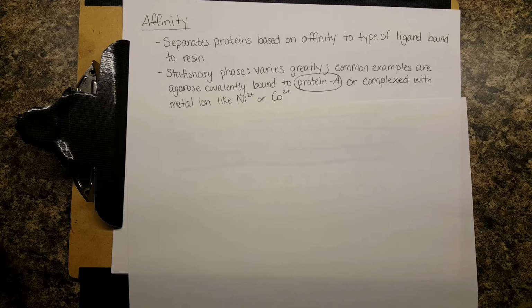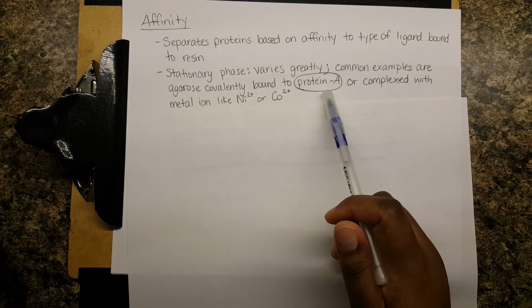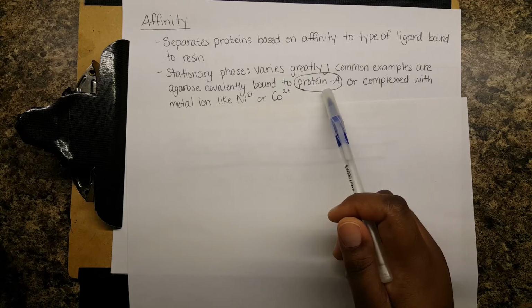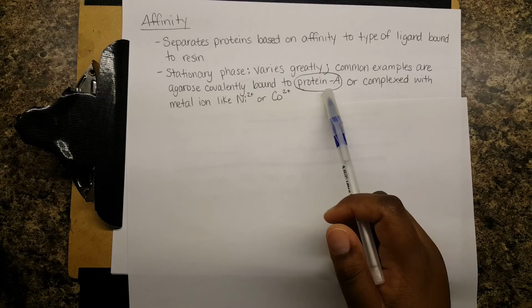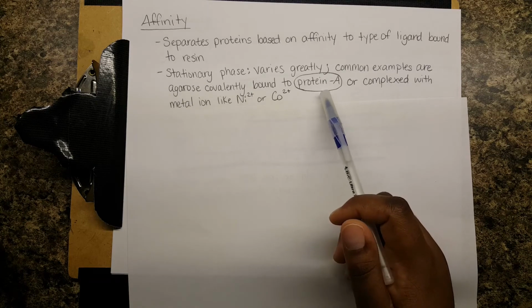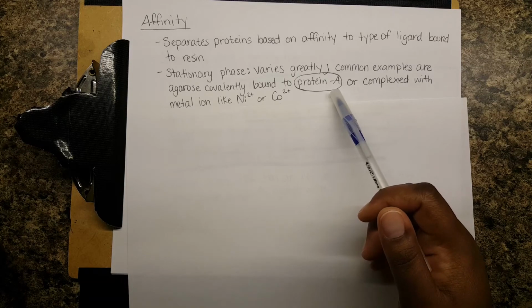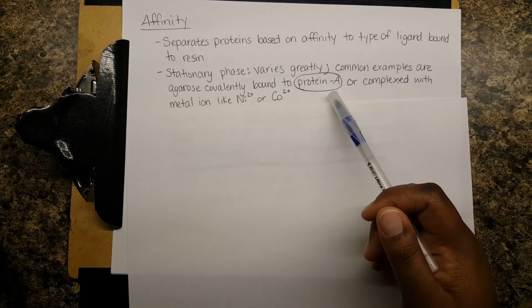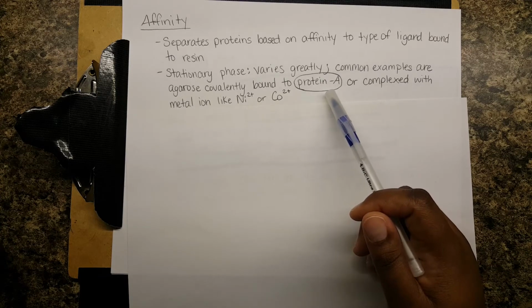A very common example is agarose that's covalently bound to protein A. Protein A binds really tightly to IgG type antibodies. So if you have something where you can use that to your advantage, you can have some kind of a tag on your protein that enables it to interact with protein A, and then all the other stuff will flow through.